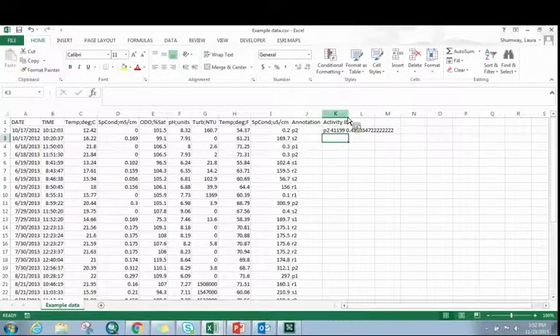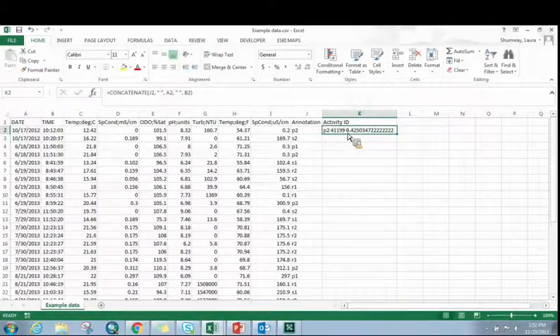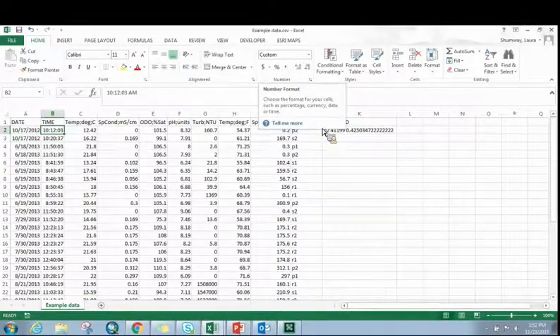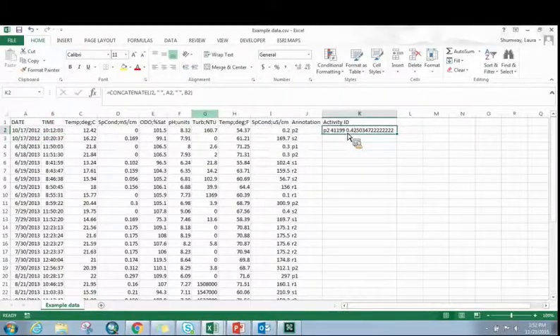We can see that what this looks like is no longer date and time, and that happens pretty frequently. Because this column is a date column, and this one is a time, or a custom column, which is essentially the time column, we need to make sure we reformat that.